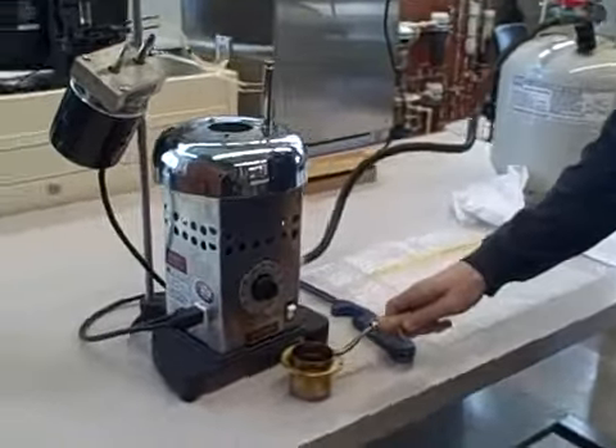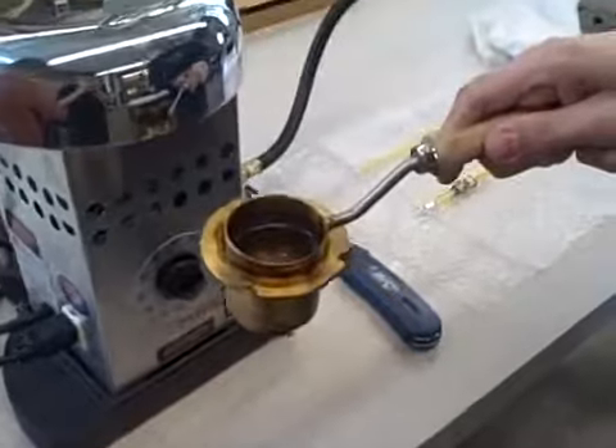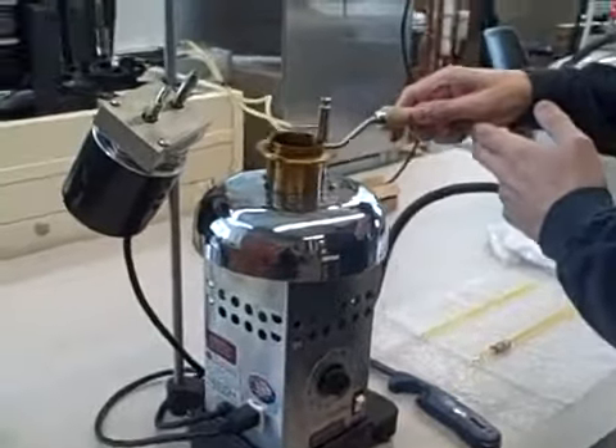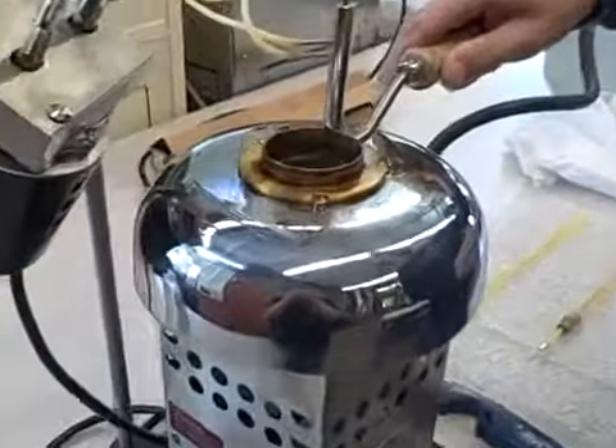After you've made sure the cup is clean and dry, you fill it with oil up to the mark, which I have in there, and then you place it onto the stove. It'll fit in with the screws there.